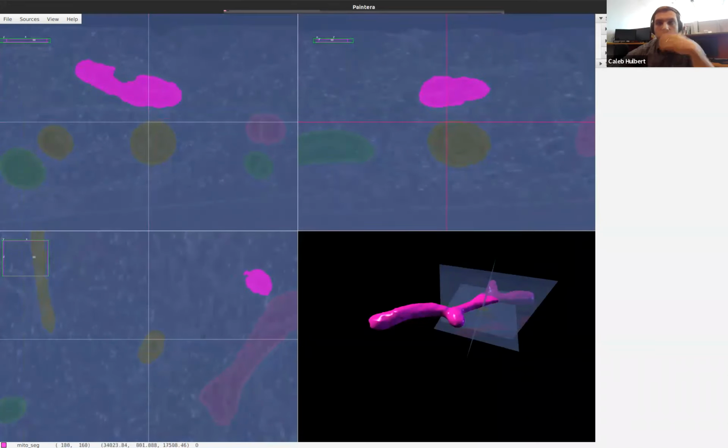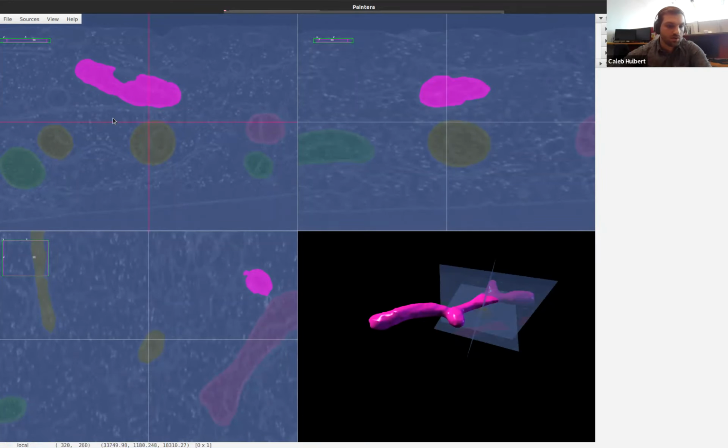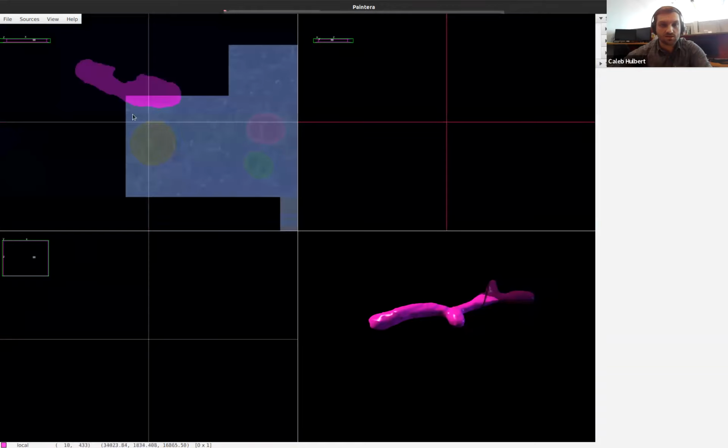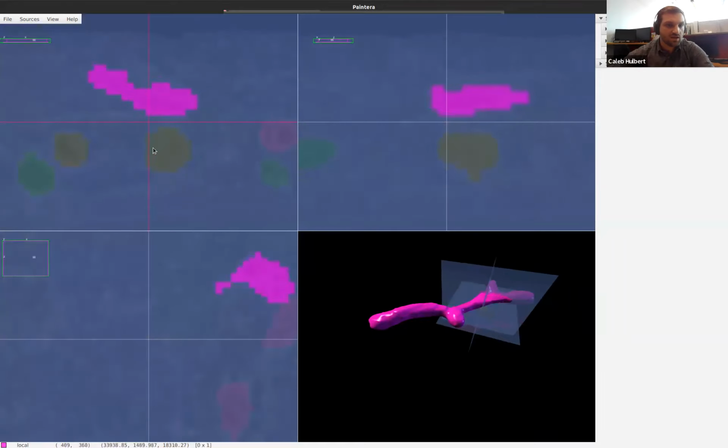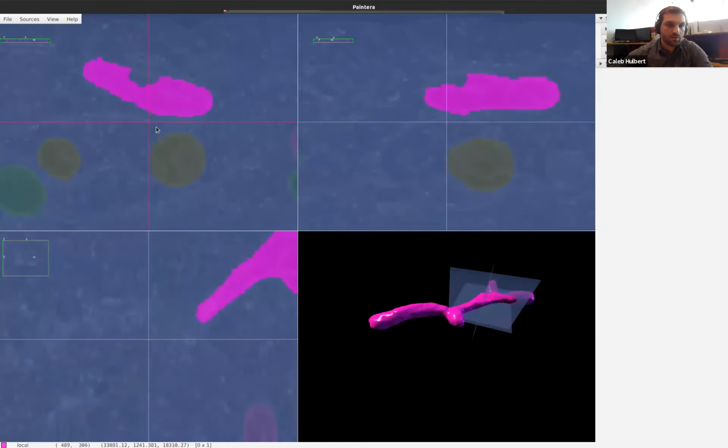So now we obviously can't edit this original one, but if you wanted to, you could modify. You could go to local and do exactly what Alyson walked you through earlier. So you select a new, sorry, it's loading the scales, so give it a second. Right, so you can go in here. We selected this one. Maybe we wanted to refine this.